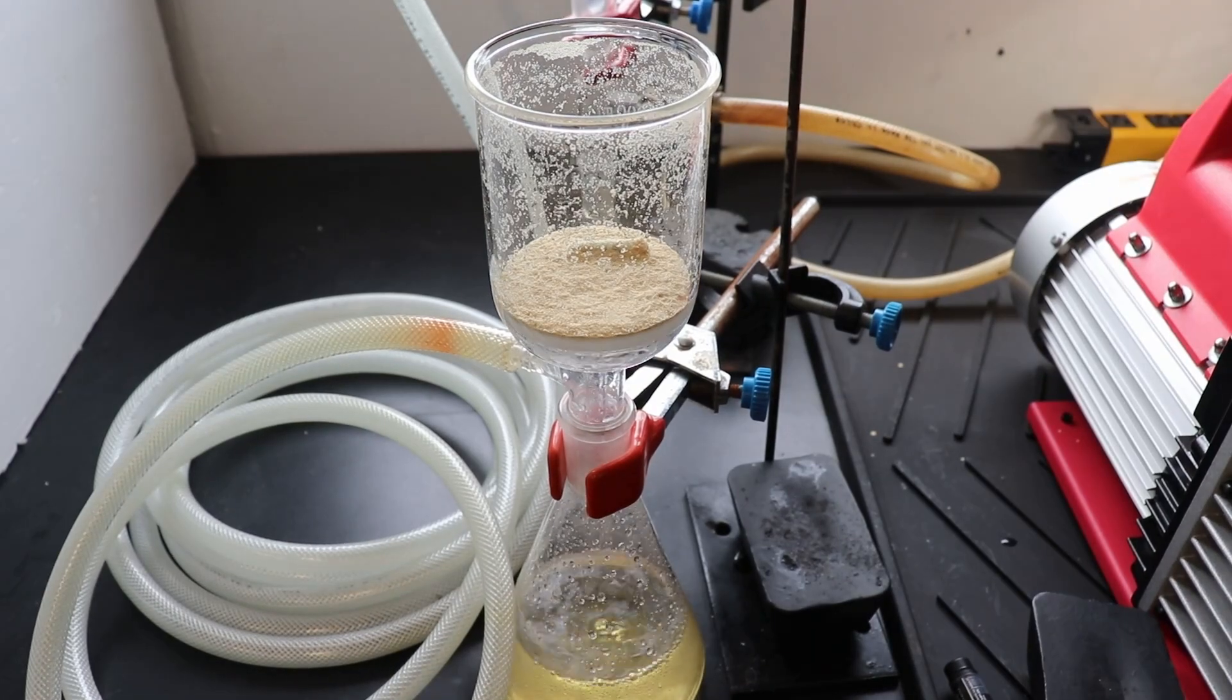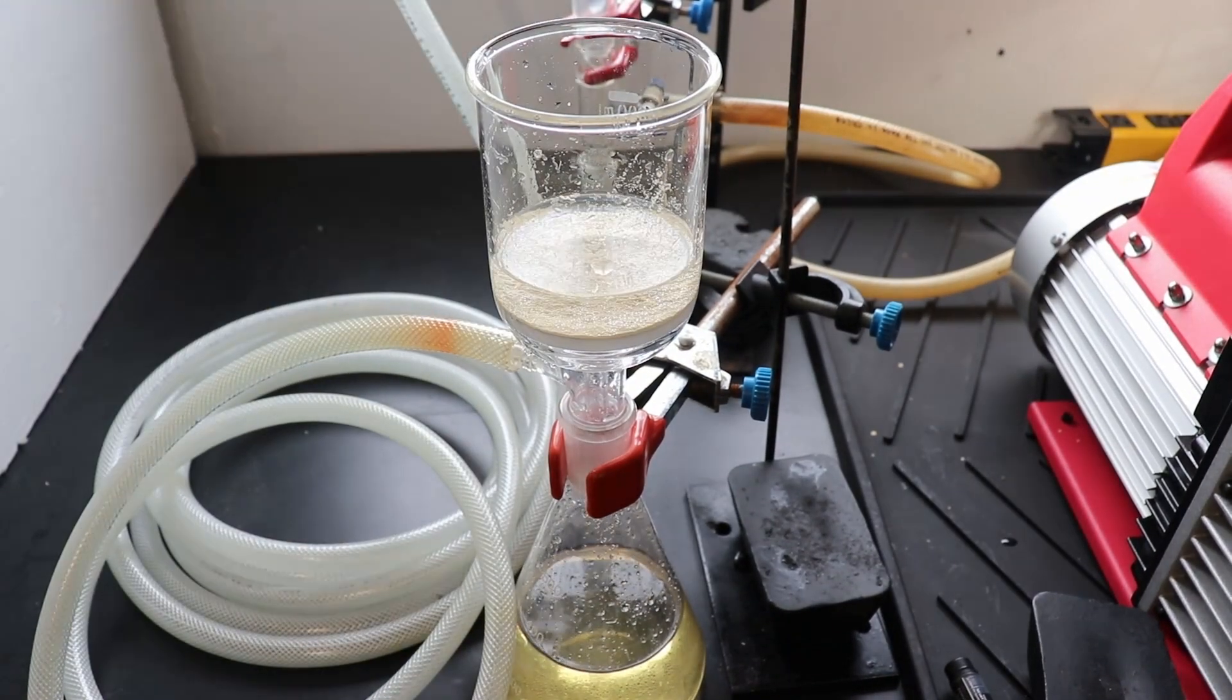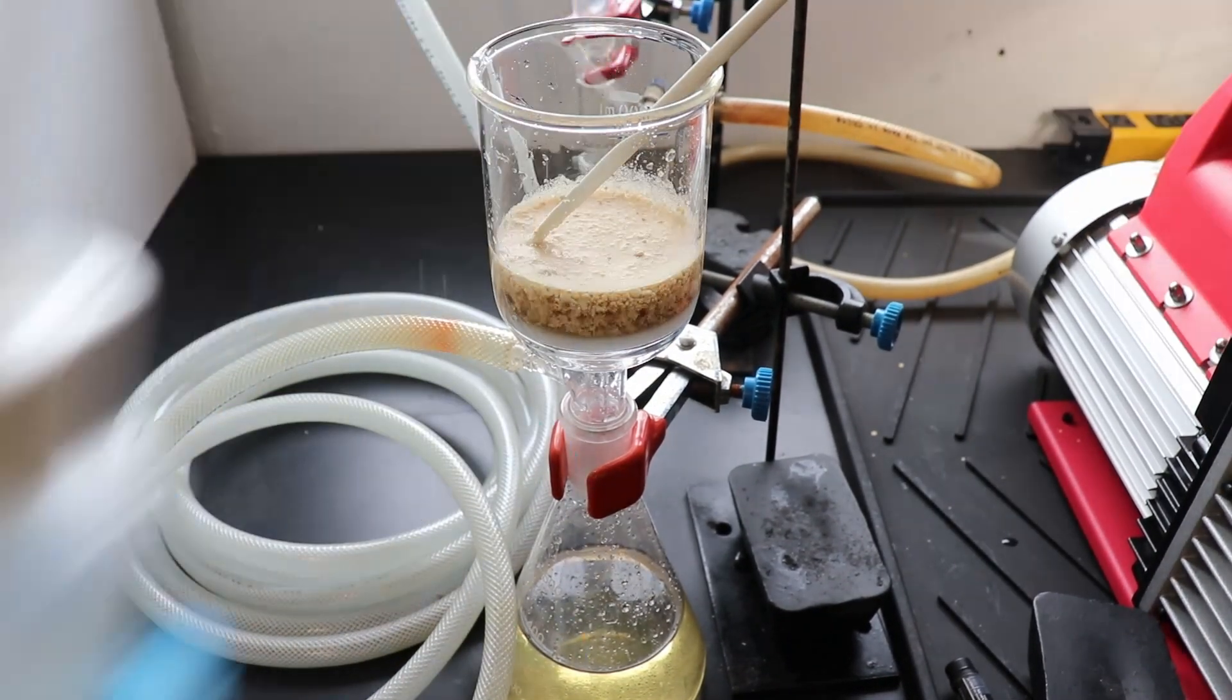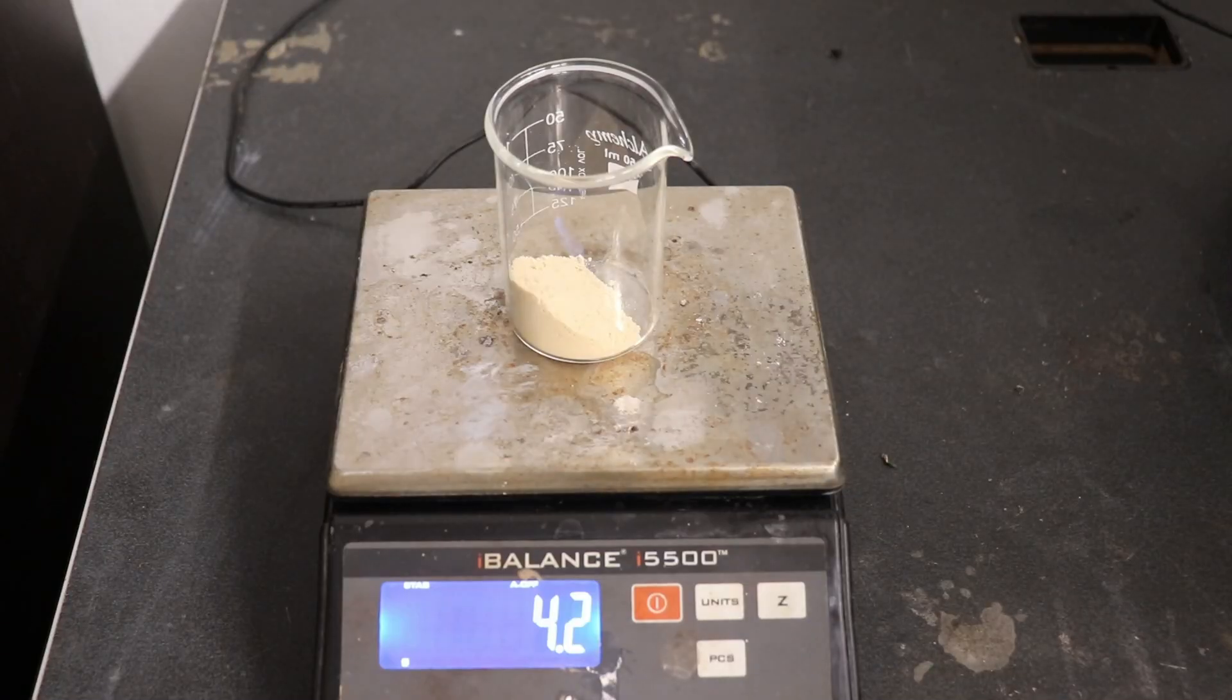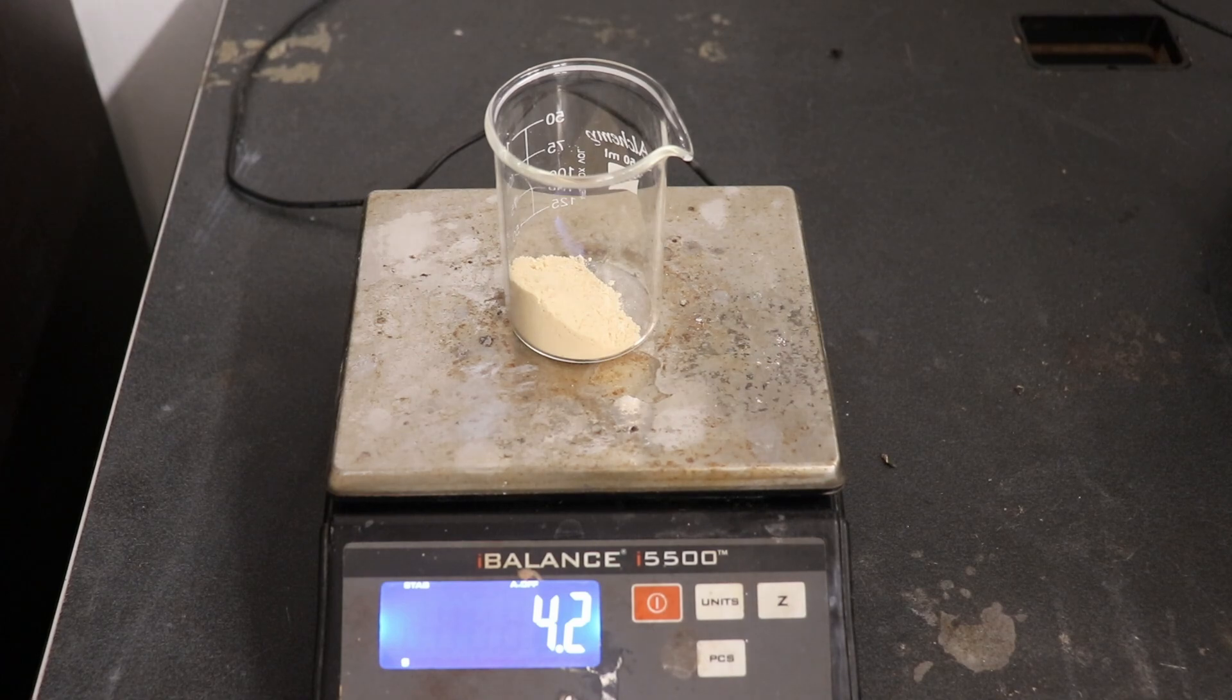The crude product was filtered off, washed with a copious amount of distilled water, and then dried thoroughly on the pump. The yield of crude 2-methoxynaphthalene from methyl iodide was 4.2 grams, which is 77%.